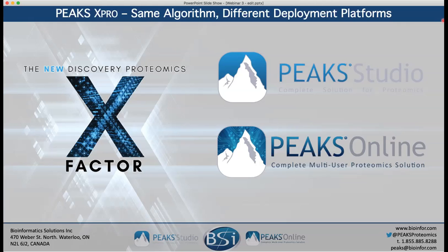So we've put a lot of work into deploying this in Studio and in Online. Online is really geared towards high throughput, large file size experiments that can also be changed and edited on the fly. And I'll hopefully show you that.